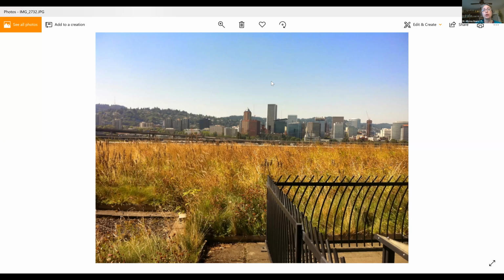But what a lot of people don't know is that sedum are facultative CAM species. So that means that they can switch in and out of this water conserving mode of photosynthesis. And a key hypothesis of my work is that they're actually not in CAM when water is readily available. And so even these succulent species can contribute to the green roof water balance and stormwater management. And so we can collect the data we need to test this hypothesis using the CI-340.